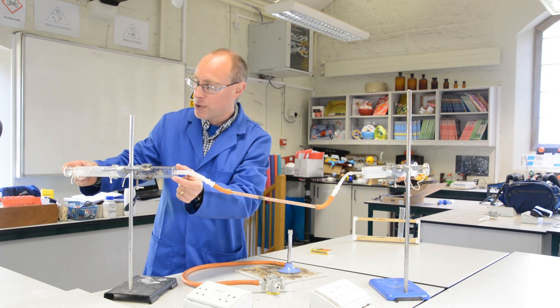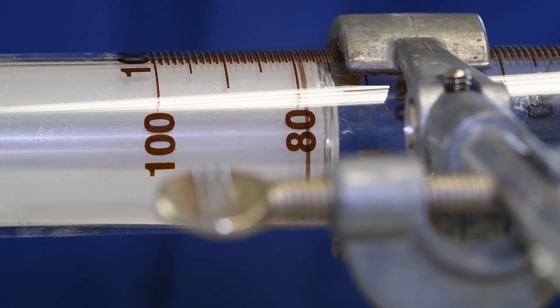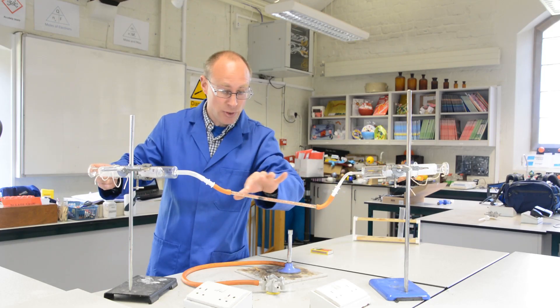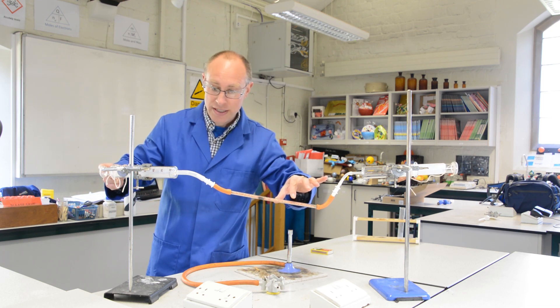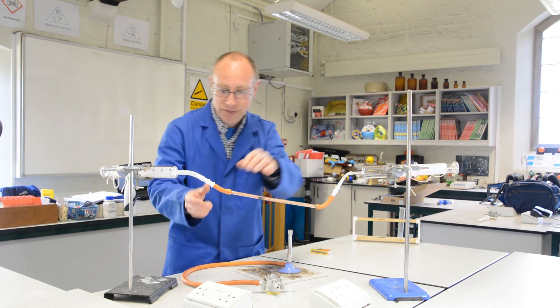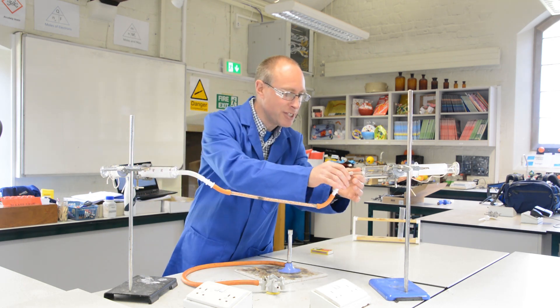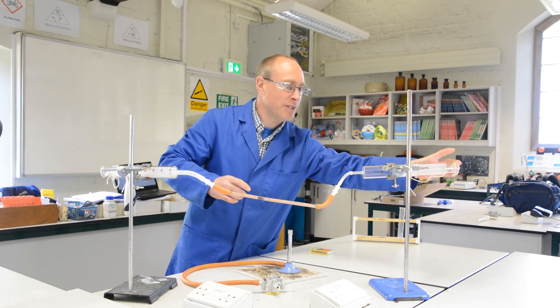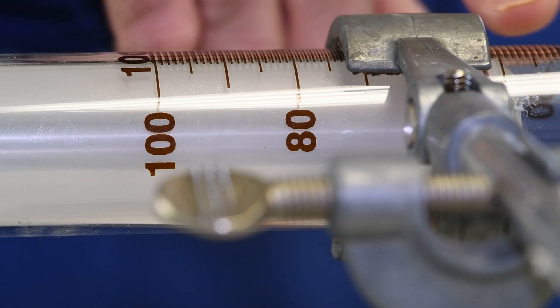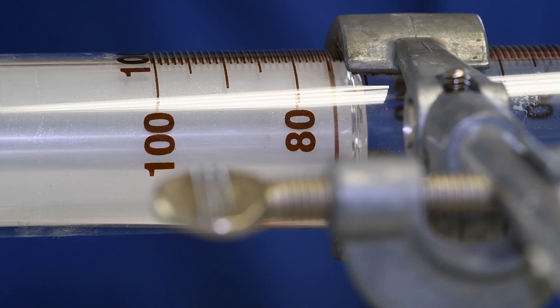What will happen is if I push the plunger on this syringe, assuming that there are no leaks anywhere in the system, the other gas syringe will move out as the air moves across the copper. And then if I push the air through here, that air will move through and into this syringe.